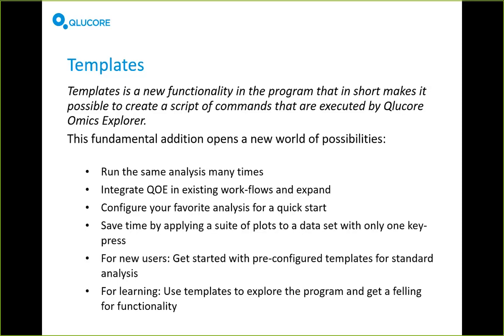And for new users of the software, this is a way to get started, because we bring in a few pre-configured templates, like 6 or 7 in the current release, to show important concepts in the program. These can be viewed as mini tutorials or ways of getting to know the program and what it can do. And we are going to expand the set of example templates that are shipped with Omics Explorer in the near future. So in the upcoming service releases for 3.5, there will be lots of exciting new little templates that you can play around with and learn the program.